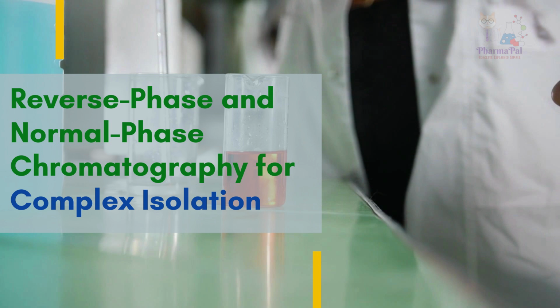After acidifying, we extract acetaminophen into an organic solvent like chloroform or ethyl acetate. Step 5. Separate the organic layer containing acetaminophen. Now we have acetaminophen isolated in the organic phase, and caffeine remains in the aqueous phase.